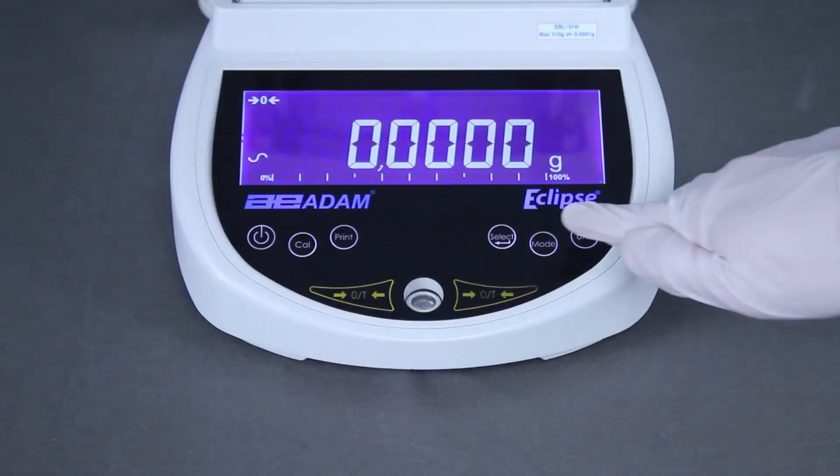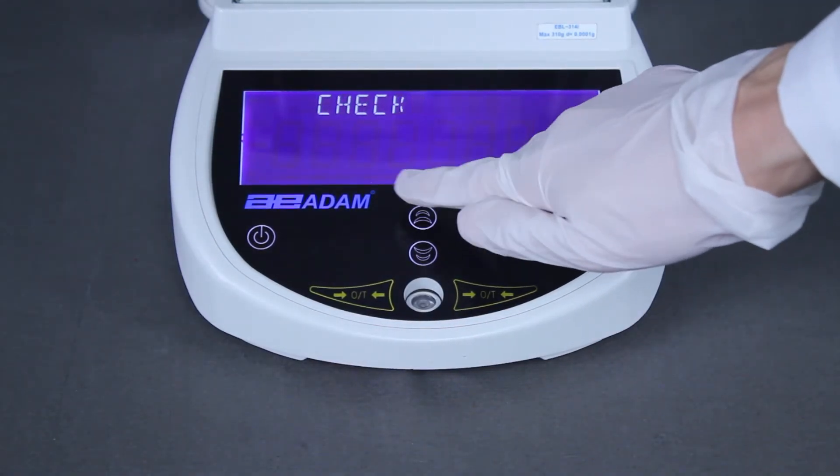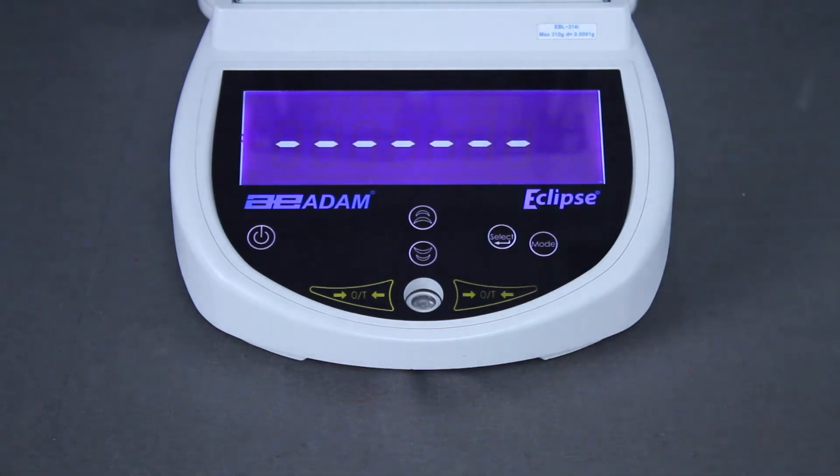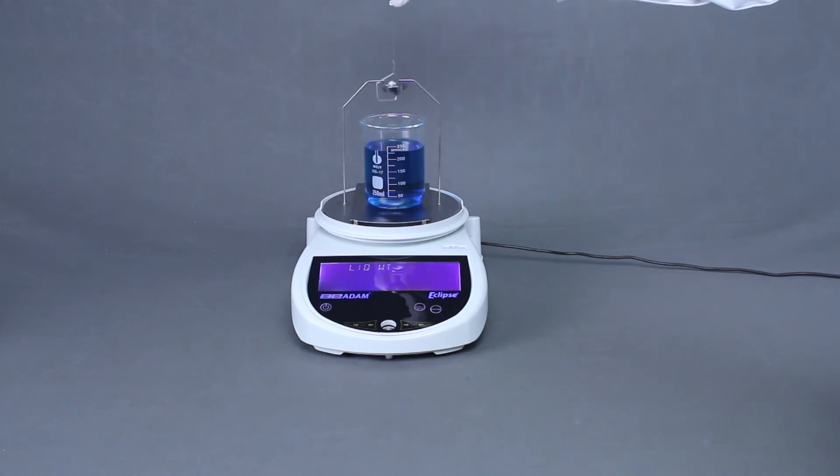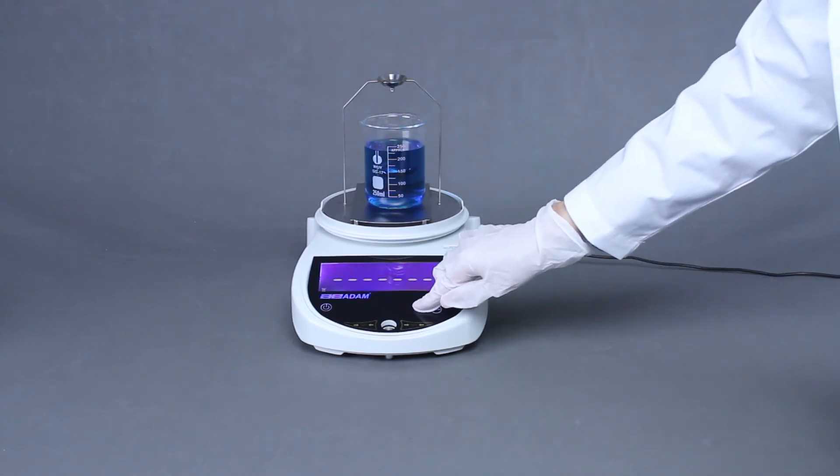The Eclipse features a dynamic weighing mode and digital filter settings to improve accuracy. Measuring the density of both liquids and solids is achieved using below-balance weighing or the optional density kit.